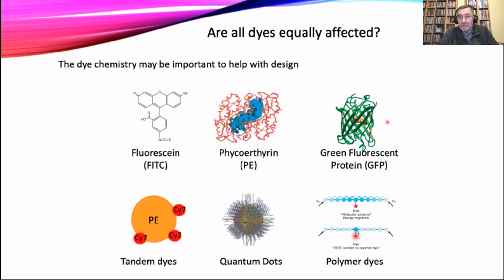So if we change the structure of the protein, it means that the protein may no longer be fluorescent. It's green non-fluorescent protein, which is why you can buy GFP or anti-GFP antibodies for exactly this case. But if you want to keep that GFP fluorescence intact, this is where I would normally use formaldehyde, which locks that structure in place and keeps the fluorescence.